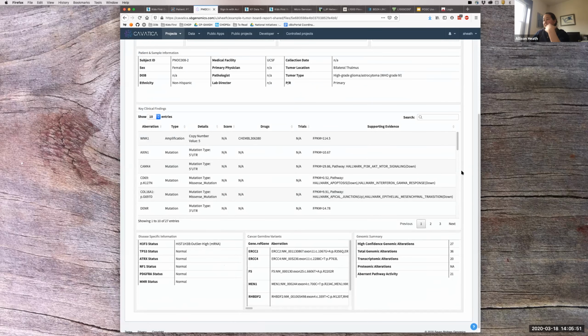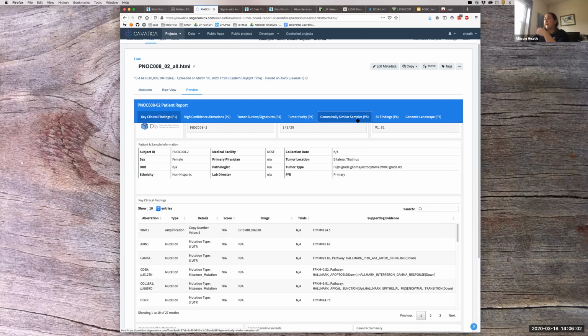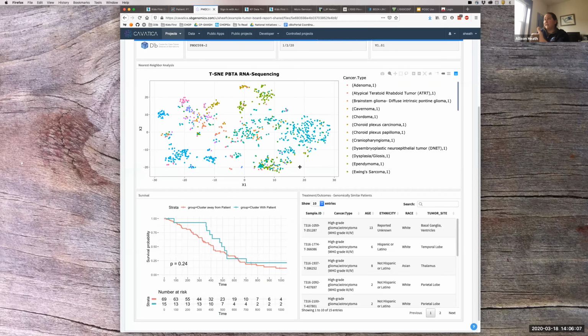This is just some test data, but really starting to bring in resources. So this is, for example, are you interested in bringing in links along with the Kids First data? And then I have my initial patient, and I can start asking myself, what's genomically similar? So I have all these pipelines on KFDRC, they're run in multiple places, and they get knit together in this report, and I can start seeing, this particular patient with this triangle here, how does it relate to what we're seeing across different diagnoses? And for example, this is a high-grade glioma.